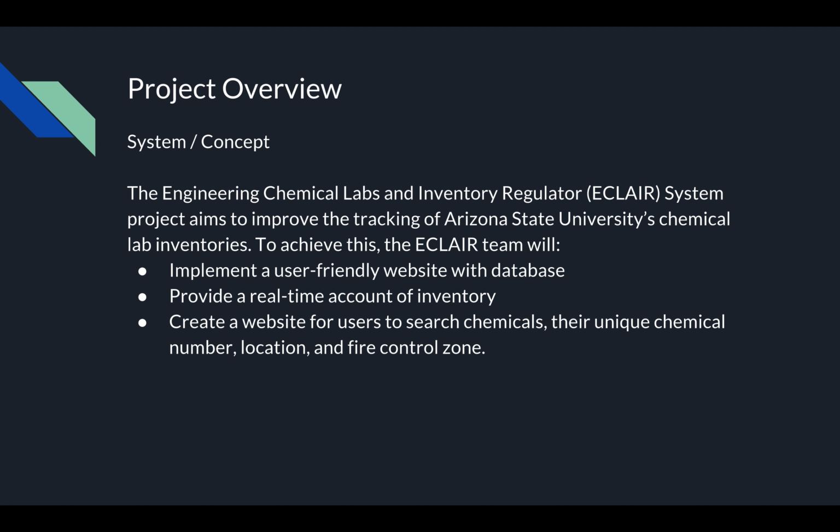And we also want to create a website for users to search chemicals, their unique chemical number, location, and fire control zone. So those are some of the functionalities that we want to provide by implementing this framework.